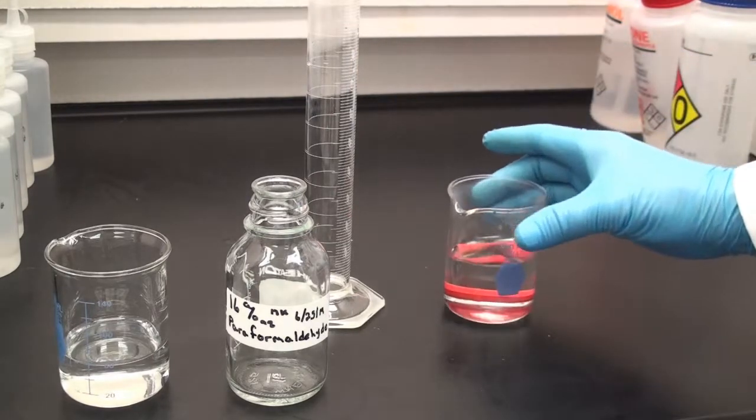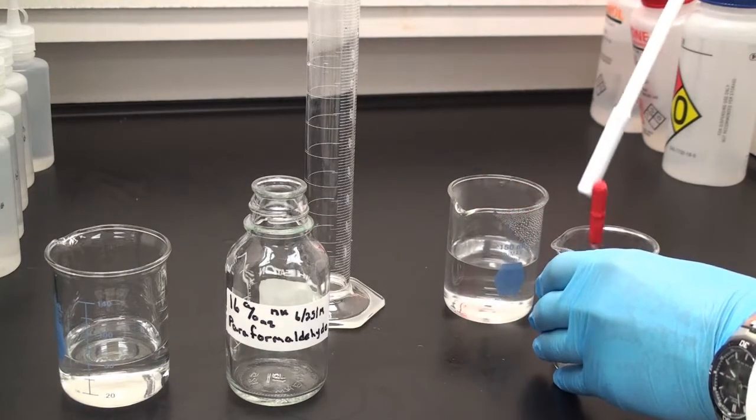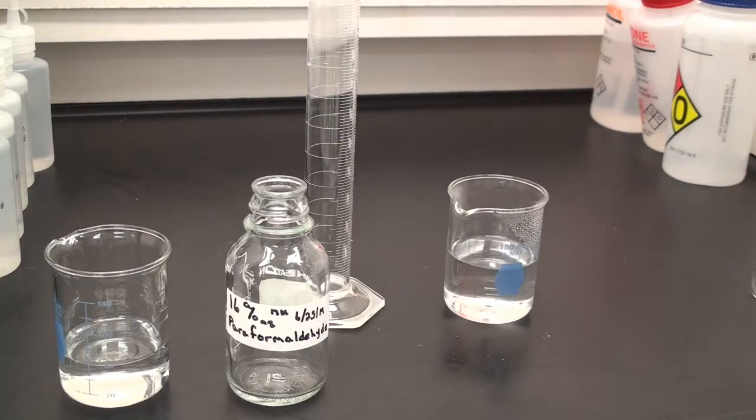So I have my paraformaldehyde with a stir bar in there. And of course, remember to remove the stir bar before you start to pour so you don't pour the stir bar into your graduated cylinder.